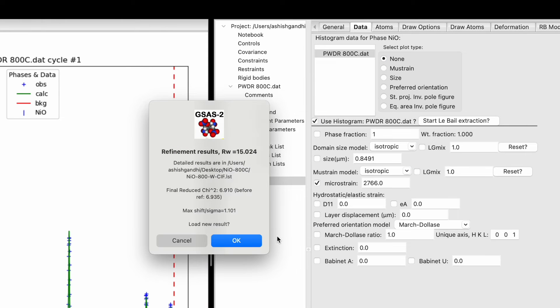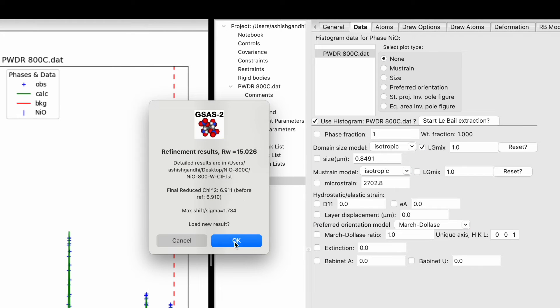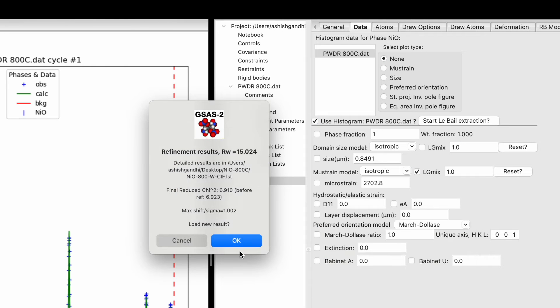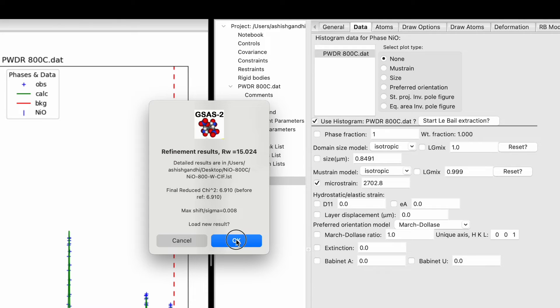Try microstrain again — 6191, the same. Click on LGMix. What is LGMix? L is Lorentzian and G is Gaussian — that is how your peak function looks. It could be a mix of Lorentzian and Gaussian functions. In that case this value should be between 0 and 1; it should not exceed 1. So we need to fix it to 1. Click LGMix, hit Command+R — 6191. Try microstrain one more time — it remains the same.